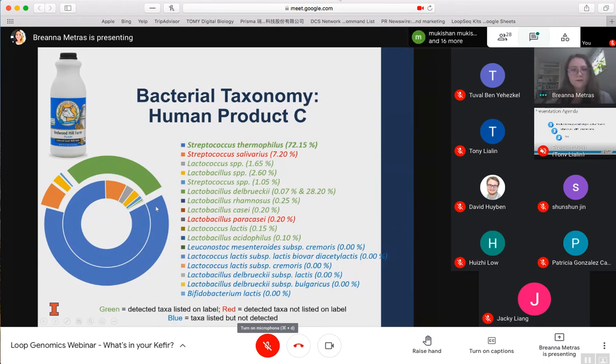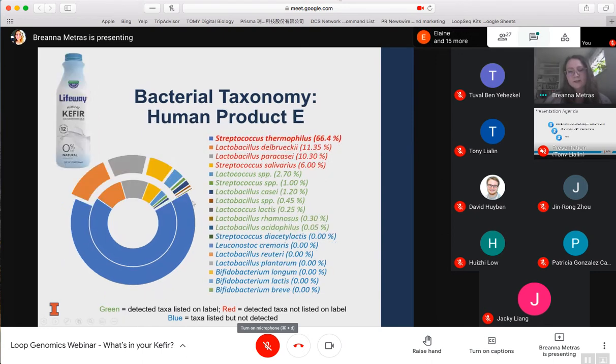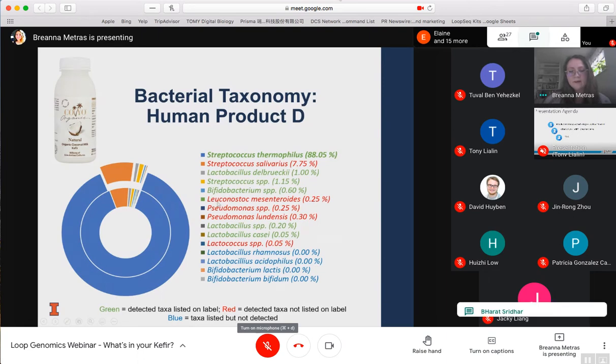All right, so moving forward, we have Koyo. It's like a coconut milk kefir, so dairy-free, but still uses the fermented process. They claim billions of live probiotics. And so again, this is our next human product. We have a highest of Streptococcus thermophilus. So it seems like when you buy kefir for humans, that's most likely what you're drinking the most of. In this product of note, we did detect Bifidobacterium and Leuconostoc. So for the other products that claim these strains and we did not find them, this was our validation that Loop and the databases were ready to receive it and definitely identified those species.